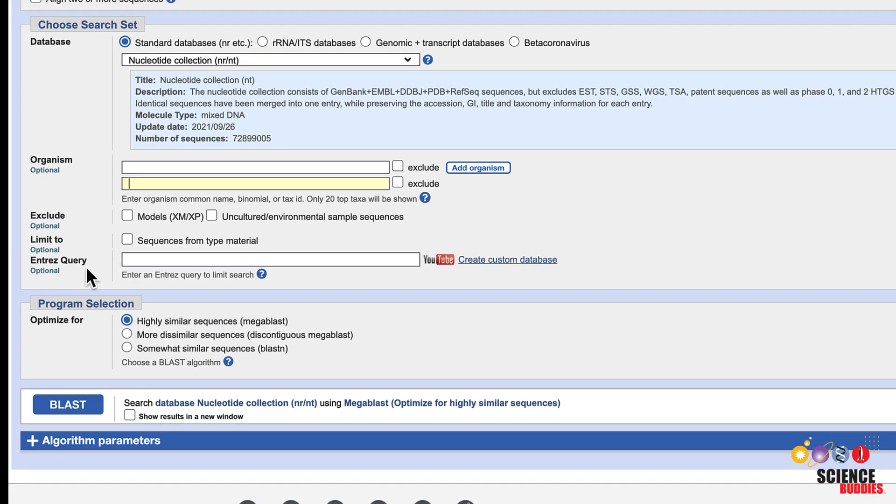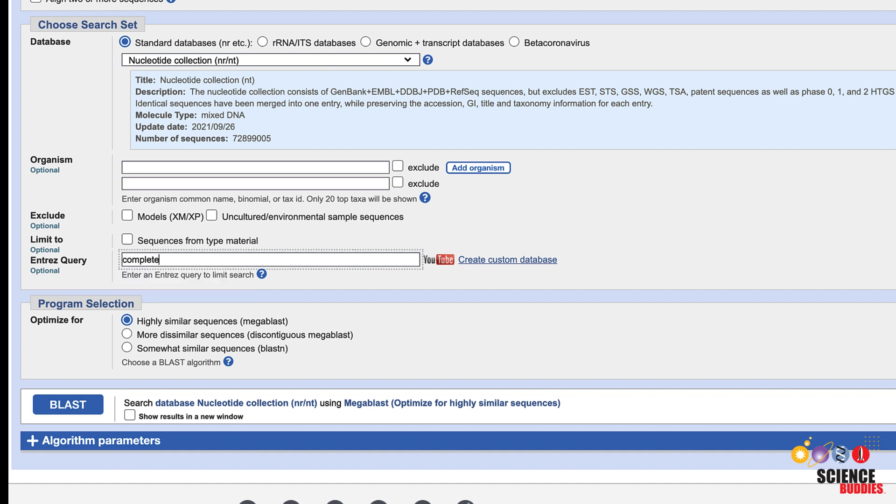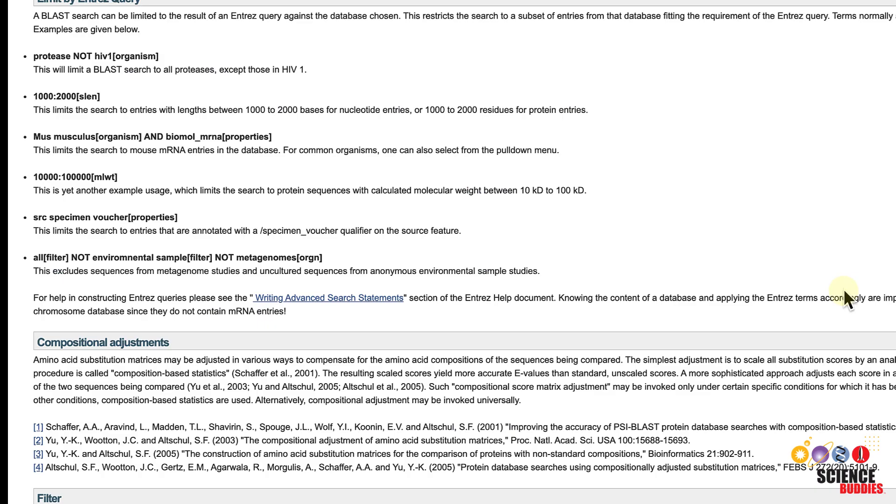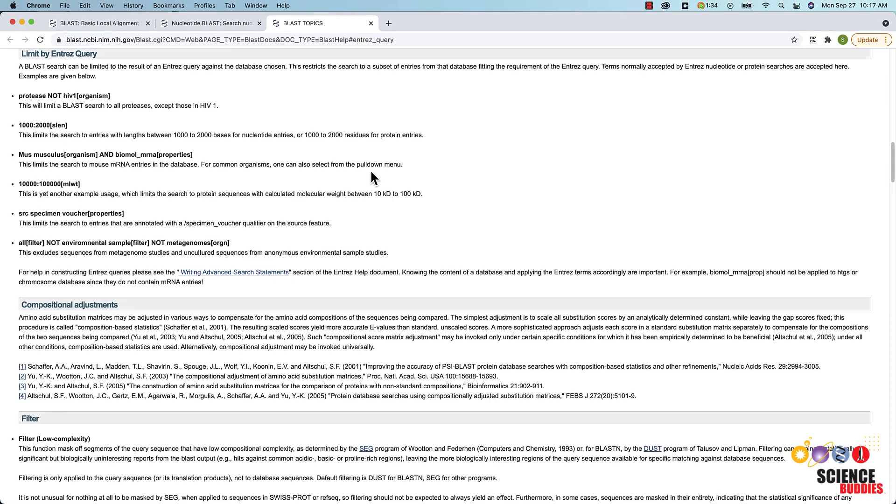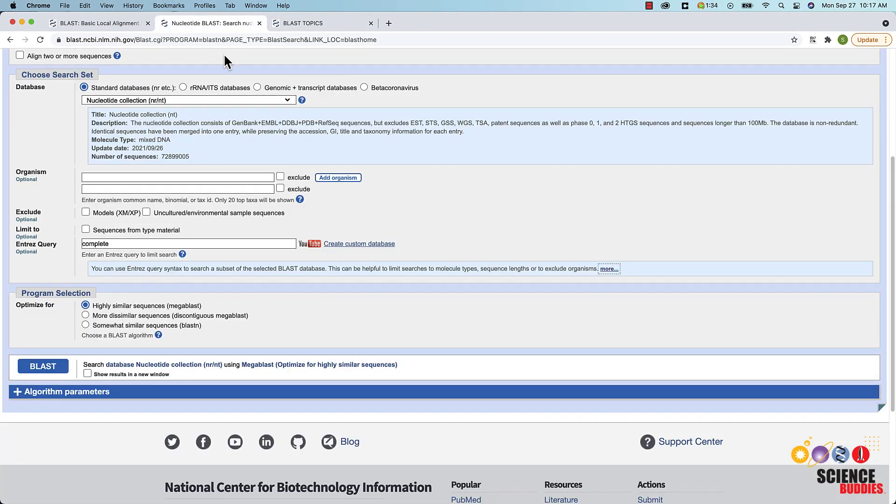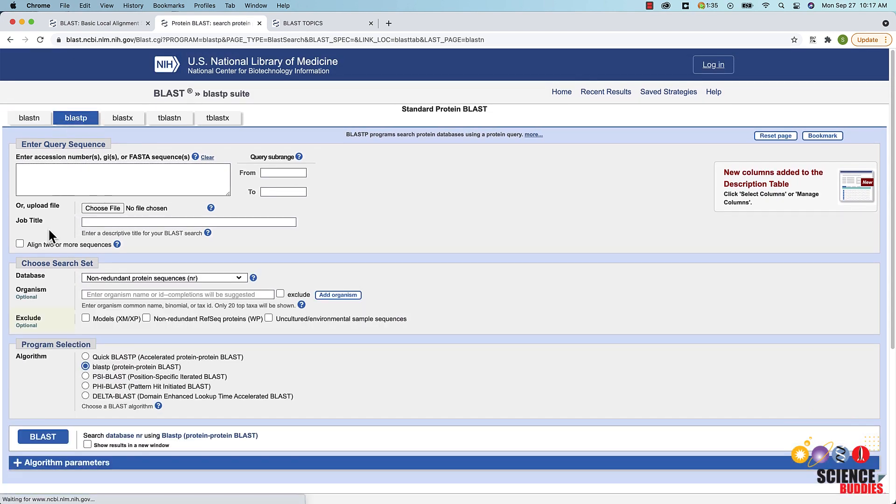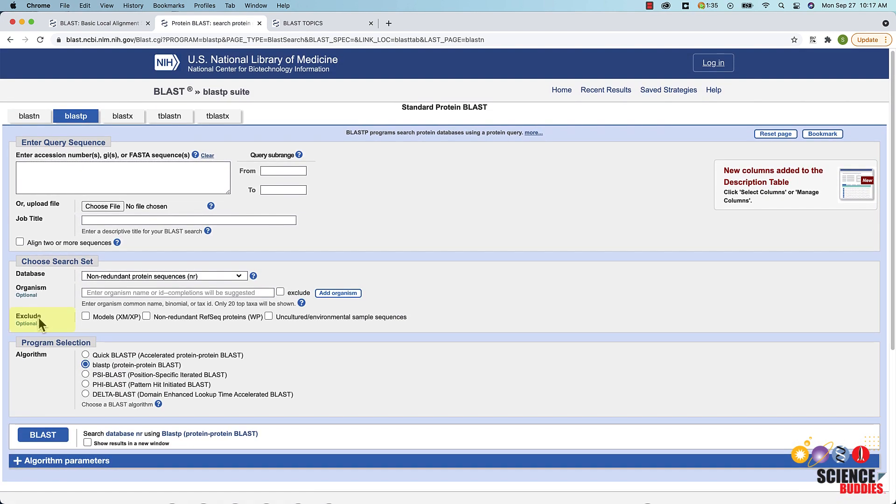In the Entrez query box, you can use Entrez query syntax to limit searches to molecular types, sequence length or specific search terms. Clicking the question mark and then more brings you to a page with some example queries. Note that the Entrez query option is not available for Protein BLAST.